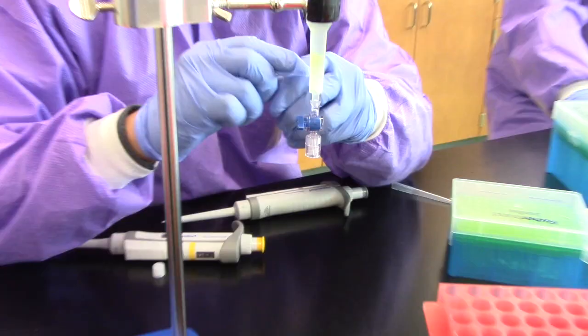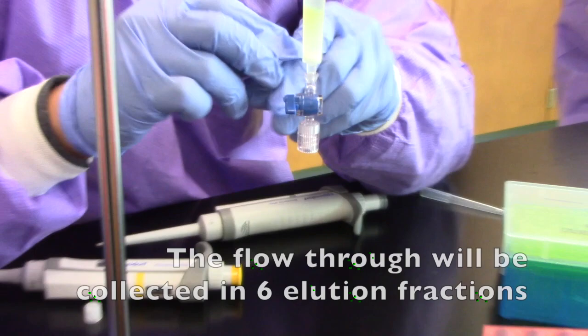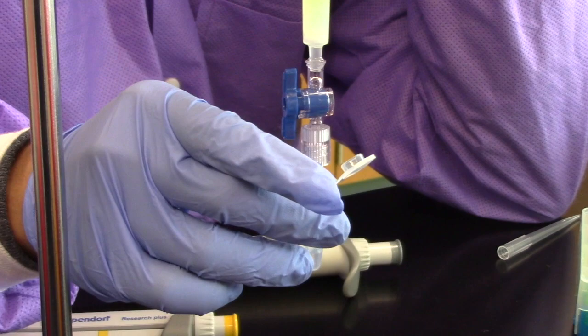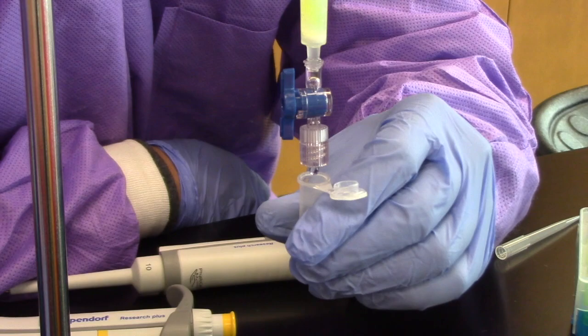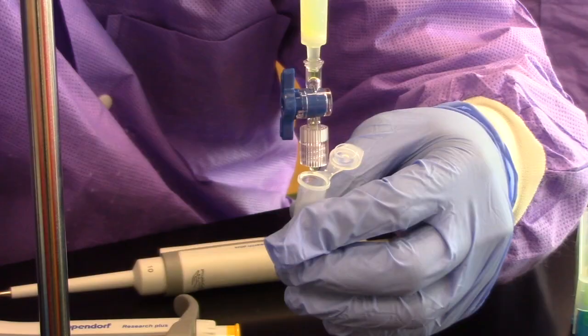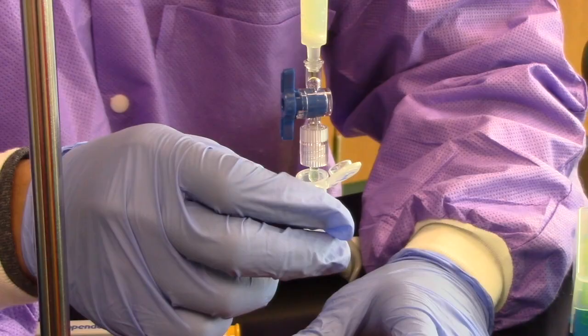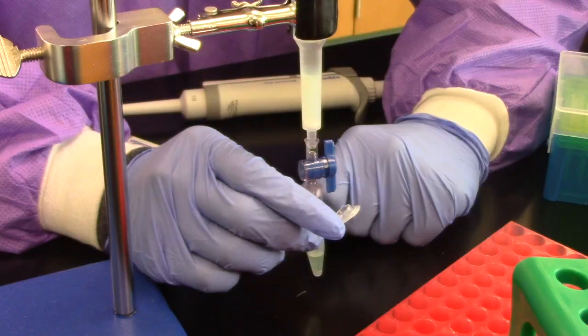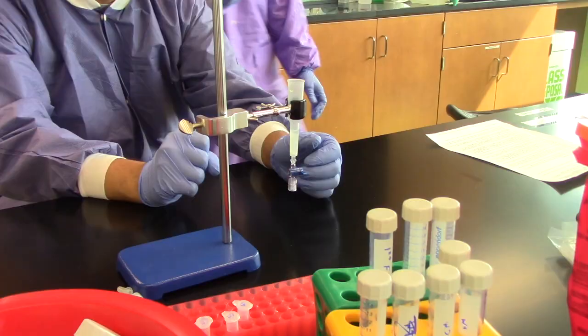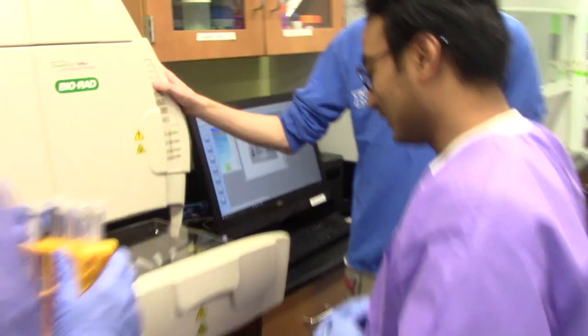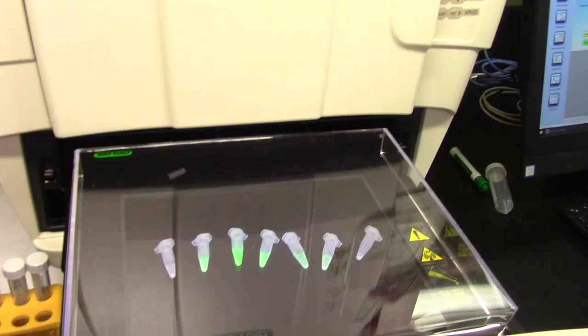The flow through will then be collected in 6 elution fractions. Store fractions for future use or fluorescence analysis. View under the UV transilluminator to see the different concentrations of Campari.